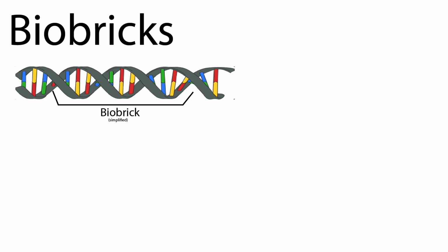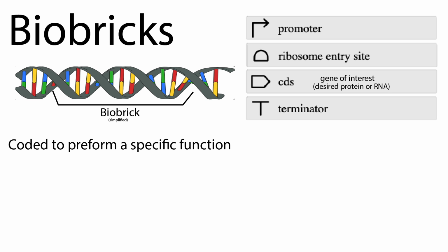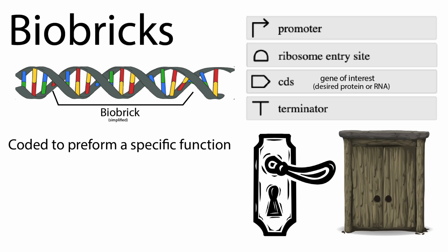In other words, biobricks refer to a specific segment or fragment of DNA that is coded to perform a specific function. Basic biobricks, which are biobricks that code for either promoters, ribosome binding sites, the gene of interest, or terminators, are like a doorknob and a door. They can only serve their function when they are combined.